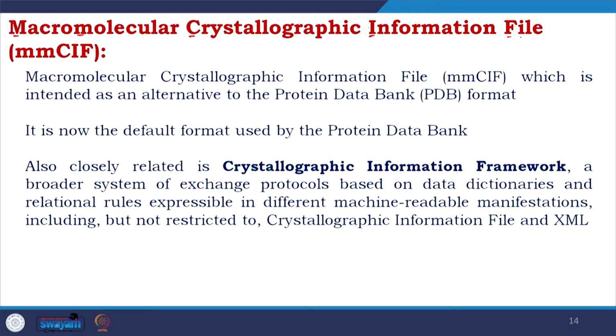Also closely related is the crystallographic information framework, a broader system of exchange protocols based on data dictionaries and relational rules expressible in different machine readable manifestations, including but not restricted to crystallographic information file and XML. So, there is an interconvertible option and that makes the use broader.